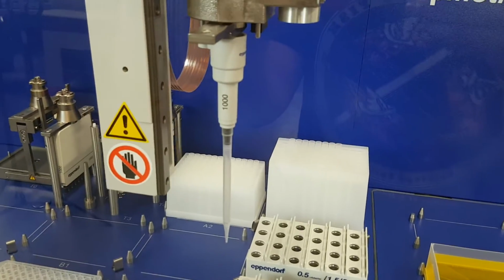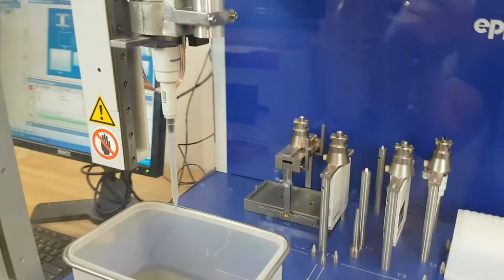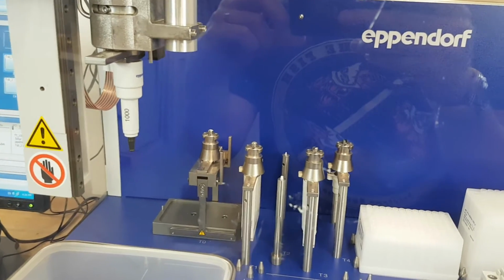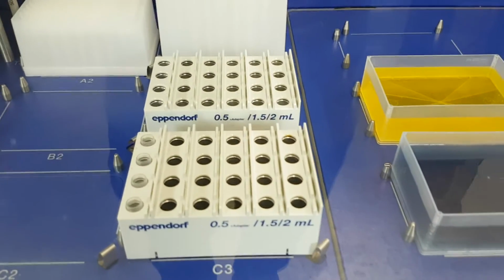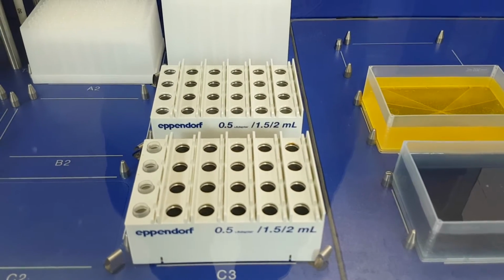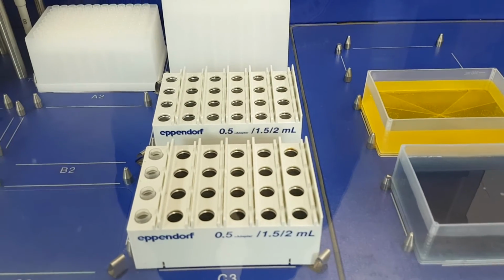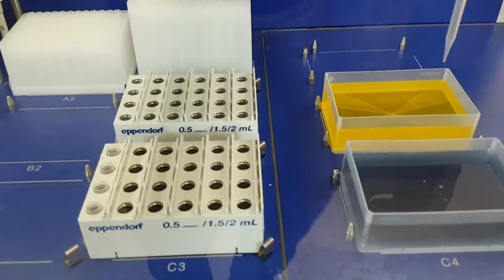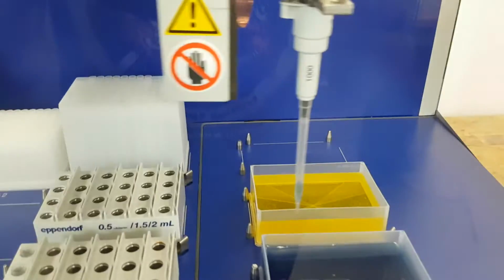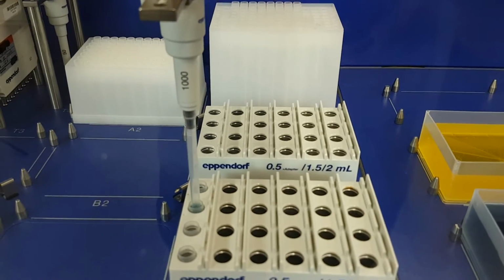Okay, so now it's going to change pipette tips, and it's going to put a varying amount of the blue water into each of the tubes. The first tube will receive none, and then the last tube will receive 750 microliters, and it goes up in increments of 250 microliters. So you see this is 250, it goes in the second tube.